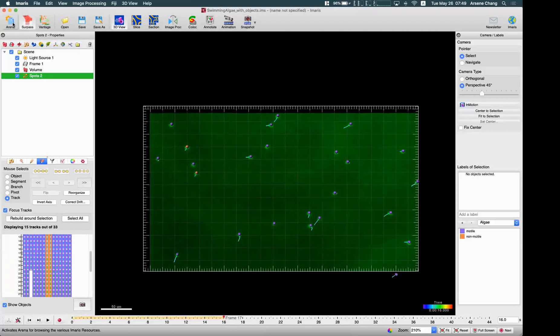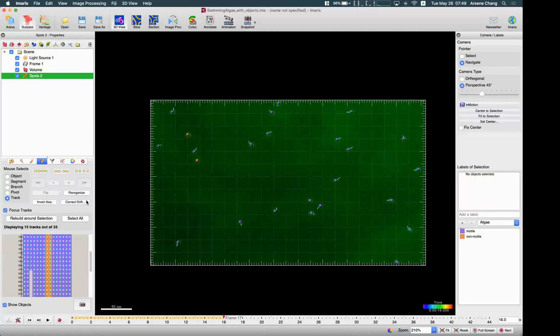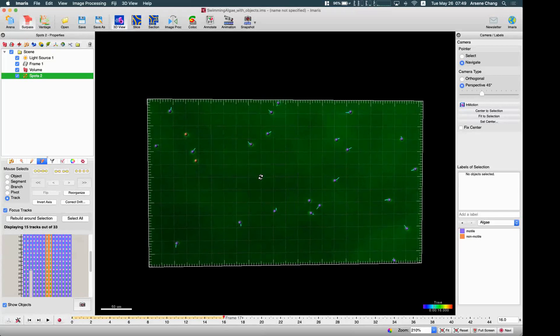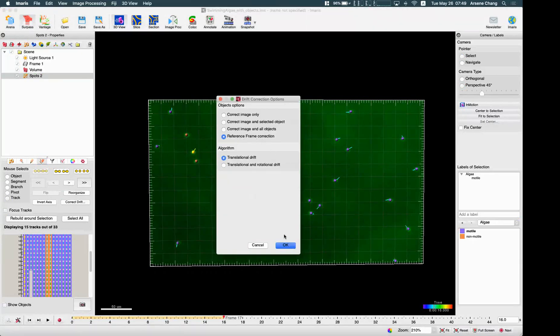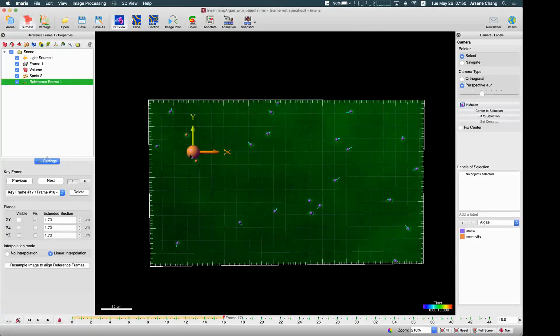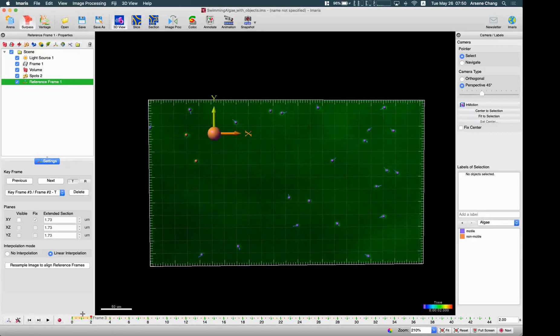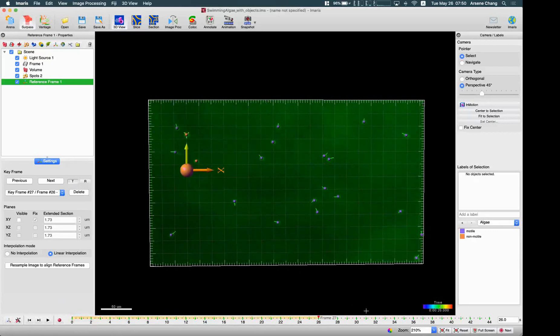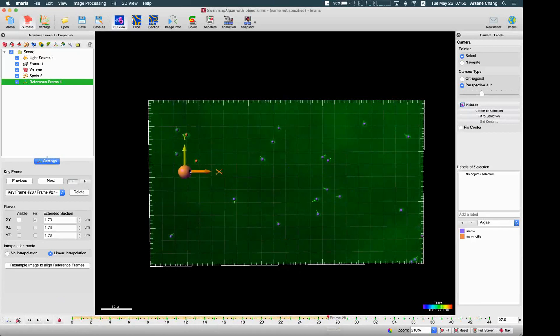That is one way you can use any markers to correct your drift. Let me undo again. Another way is to use the reference frame correction. Reference frame correction is also similar, but if I pick a reference frame correction, in my reference frame it will pin the reference frame to the spot I selected. Then along the time lapse, this reference frame is always fixed on this spot I selected.